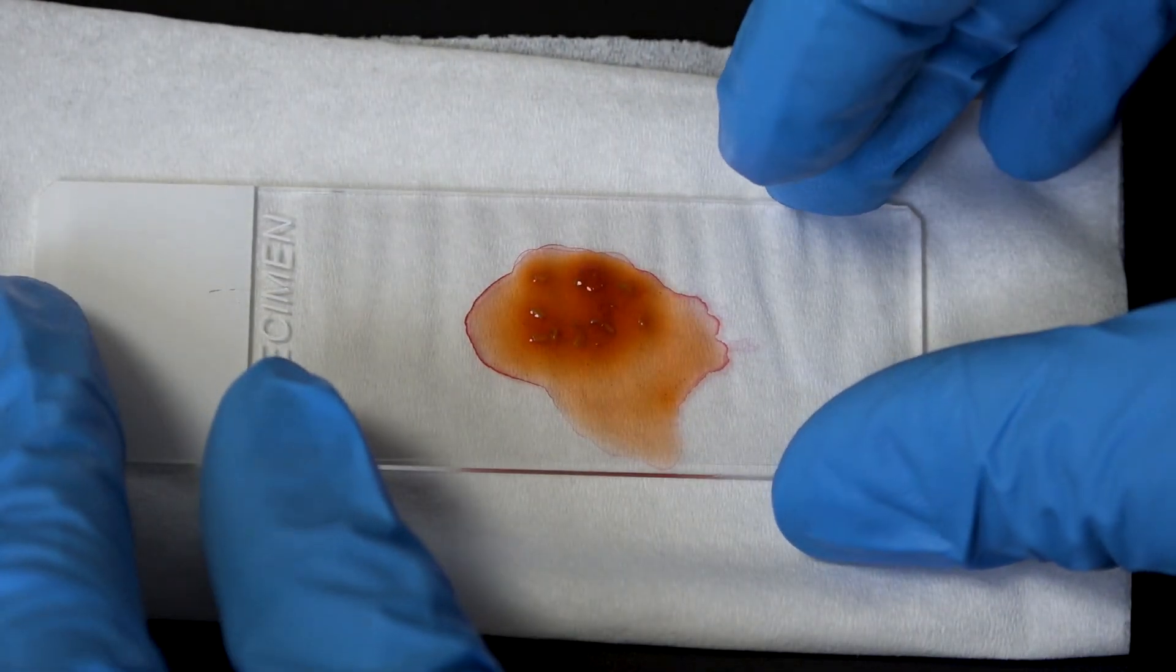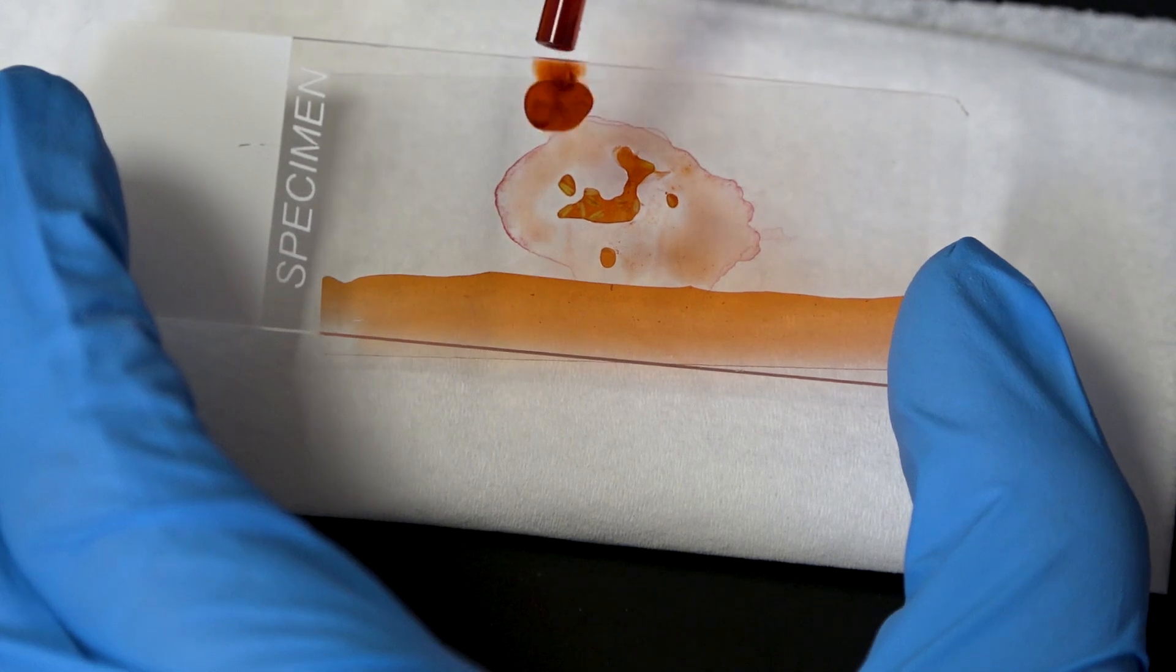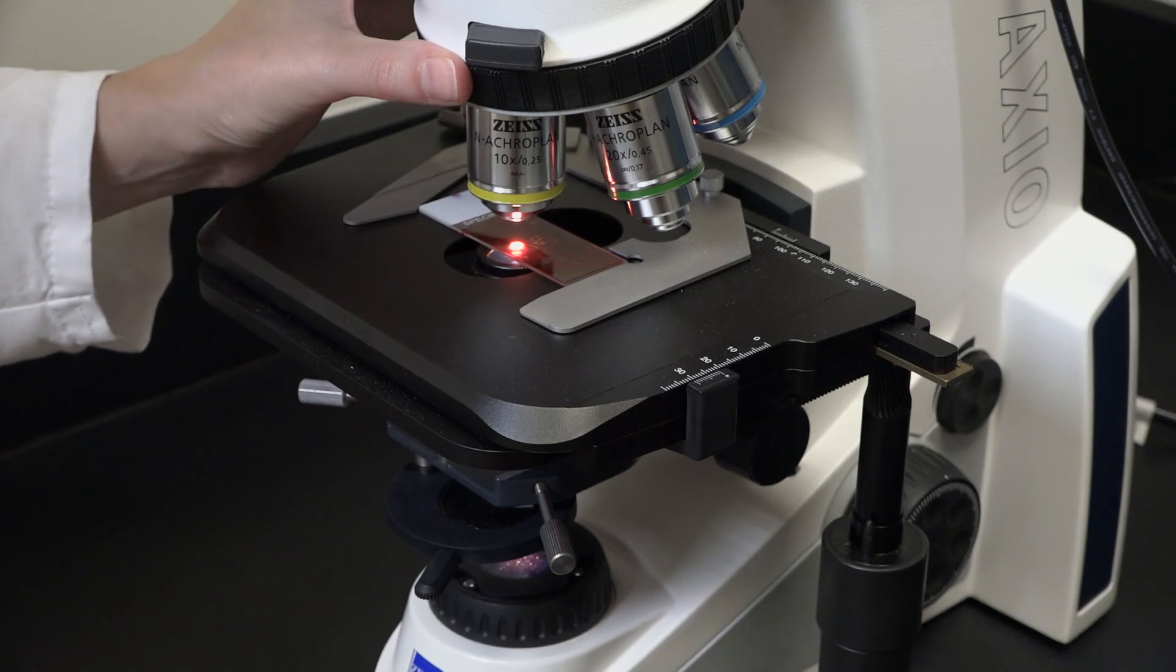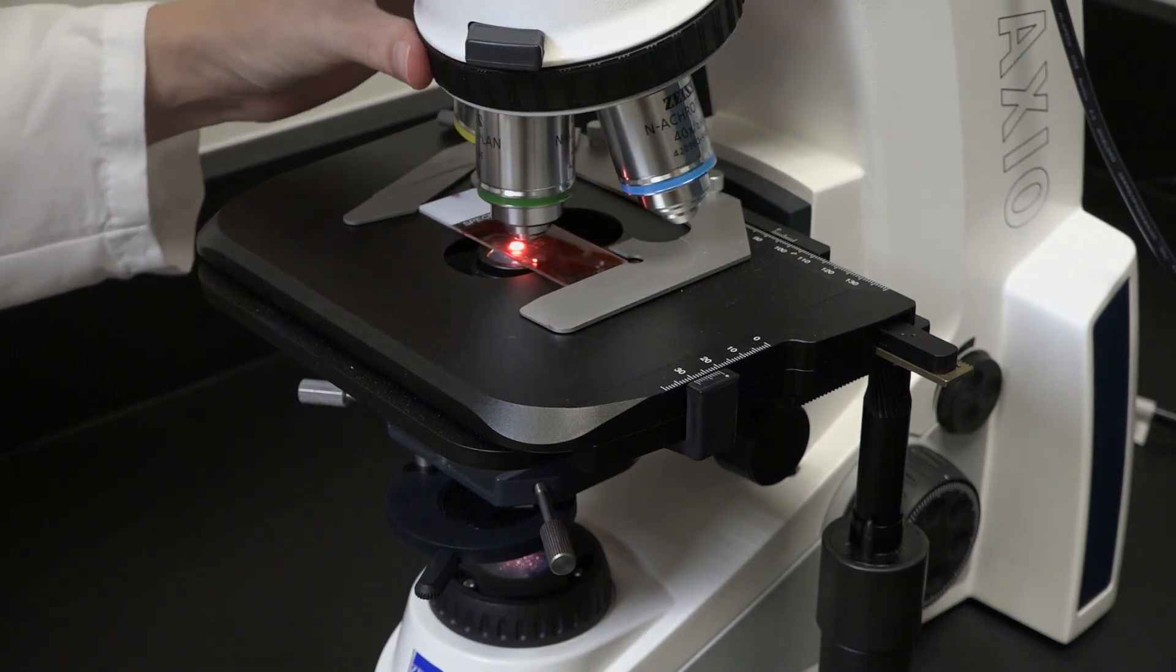Then all we have to do is place a cover slip on the slide, add a little more stain to fill in any air pockets, and pop it onto the light microscope. You'll need a pretty high magnification, something like 40x or above.